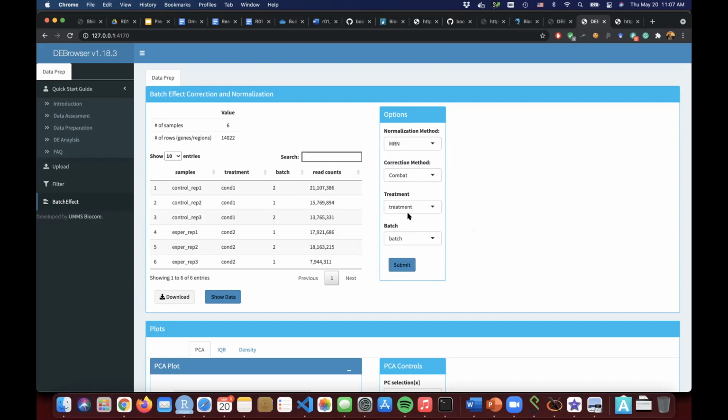And sometimes some donors can be different, and you can use donor as a batch, because different donors might introduce more batch problems. Even if there is no batch effect, the donor may have different health conditions and so on. You might need to use that donor in the batch just to correct the data, and then do your experiments on the conditions like healthy versus, for example, cancer, whatever the condition is.